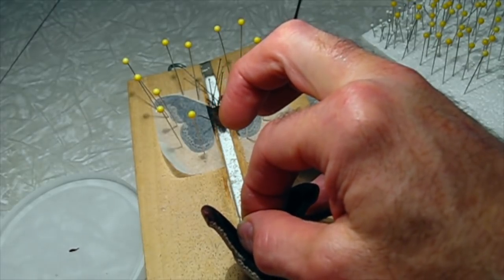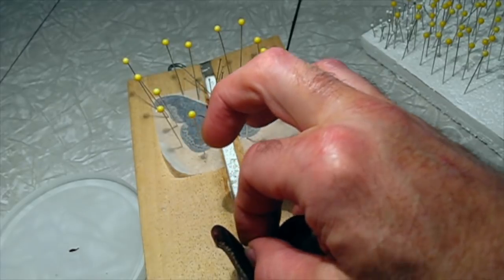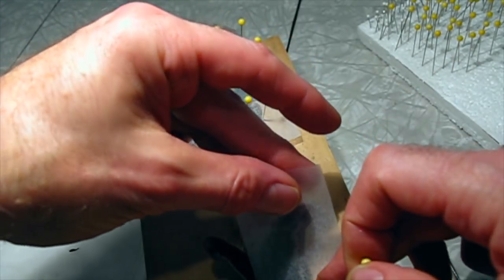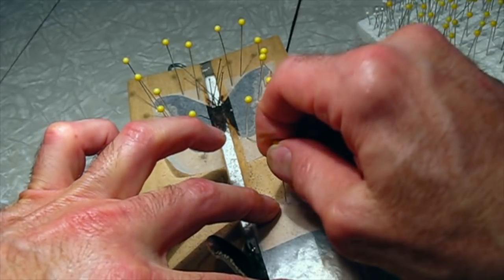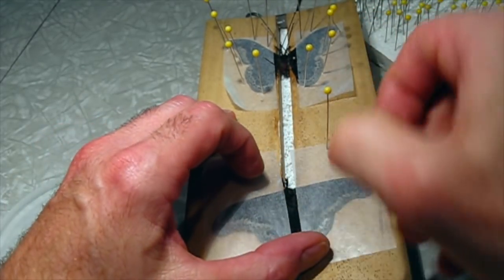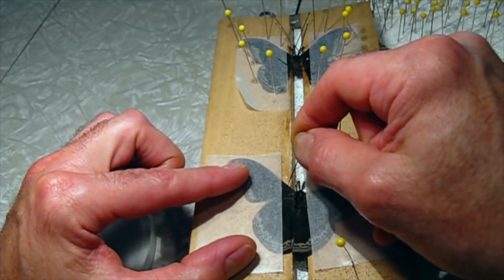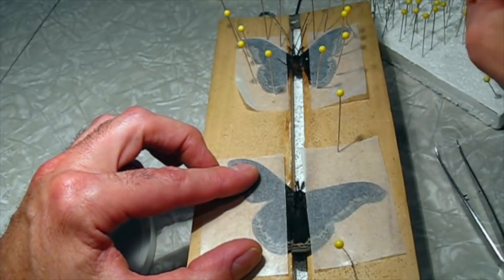For the second one I'll do the same thing: get it right in the center of the spreading board and make sure the pin is nice and straight. I've got my glassine sheets. I'll brace the abdomen first, then hold down the right wing, and put a glassine sheet on the left. I grasp the wing edge with a pin and raise it up until it's perpendicular, set the glassine at the top edge of the wing, and pin it in place.